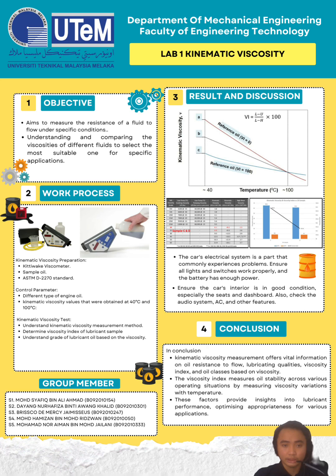Assalamualaikum, my name is Mohamad Hamizan bin Muhammad Ridzwan, and today I want to present my part, which is the work process for kinematic viscosity. There are three main points: the kinematic viscosity preparation, the control parameter, and lastly the kinematic viscosity test.